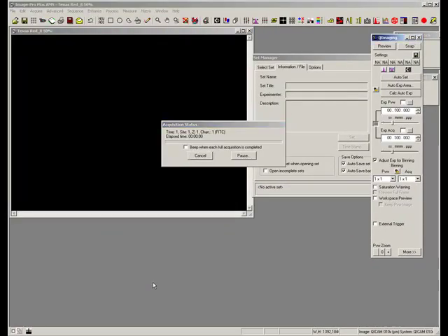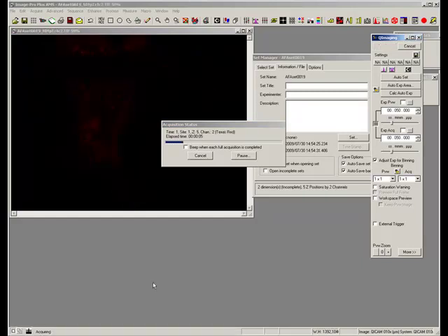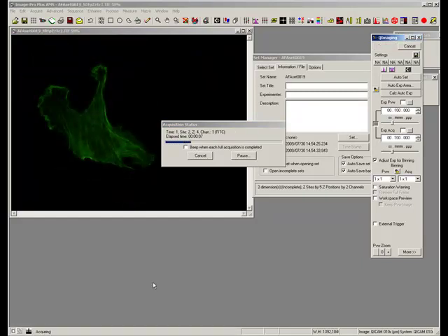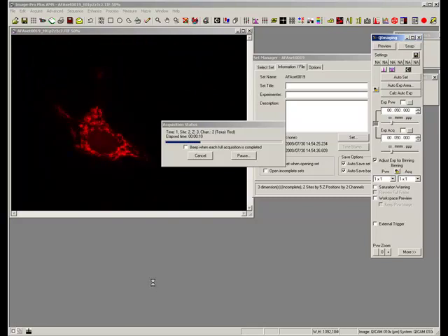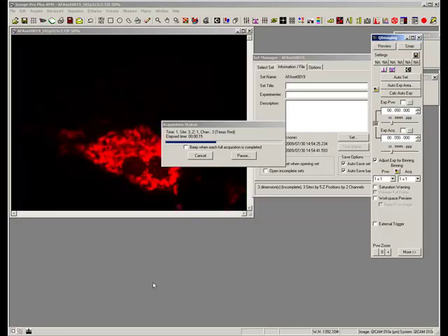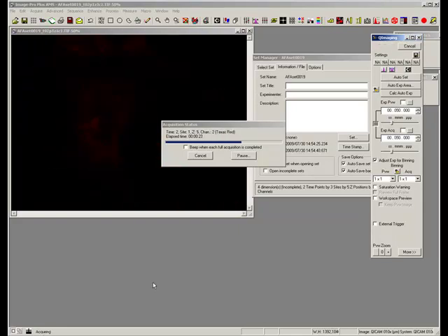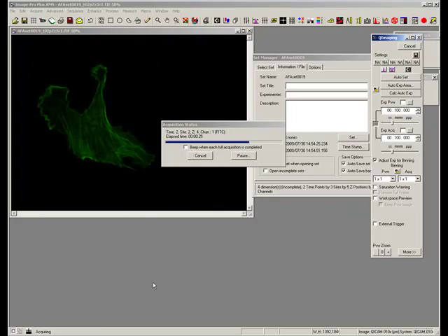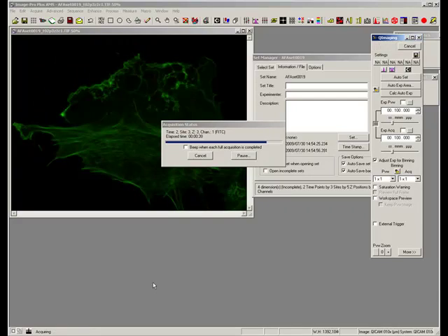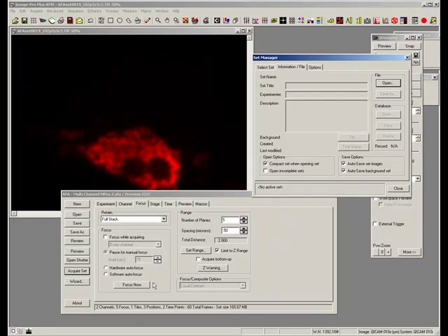And this is a whole experiment now acquiring. So the first image is pretty straightforward. One thing you'll see is AFA will go and get a black image first. That's actually just setting up the workspace so it knows where to put the images. It's pretty neat. It helps save stuff as well. It looks like that one was a little bit brighter than I thought. We can also have it auto expose each time as well. But AFA is a pretty straightforward tool. It allows me to do very routine time-lapse analysis, multiple positions, and also straightforward imaging.